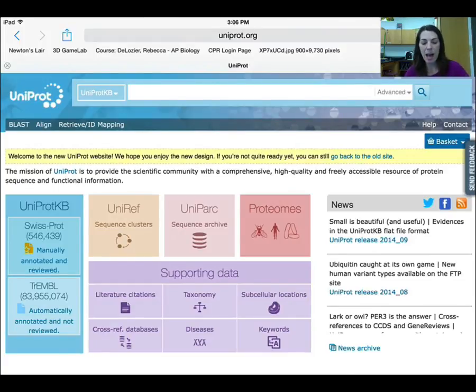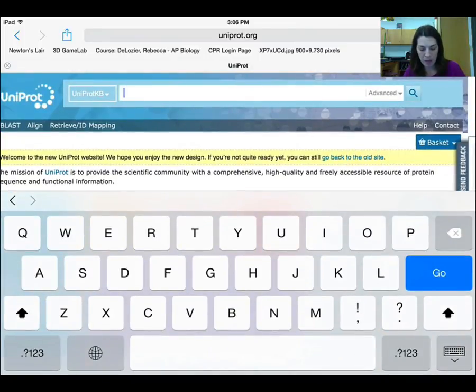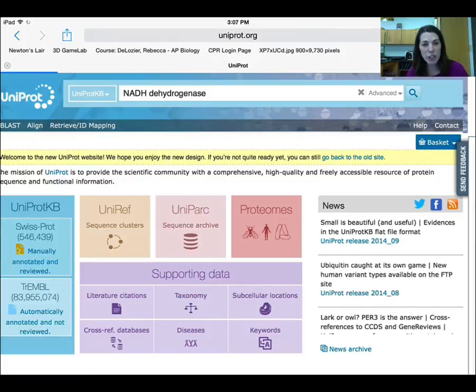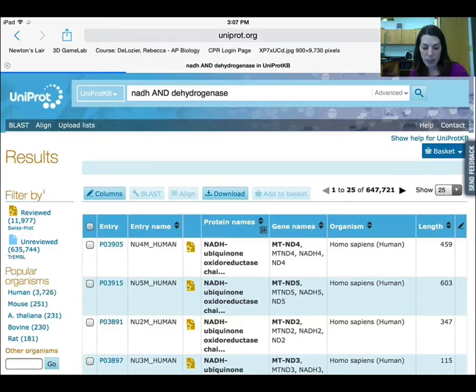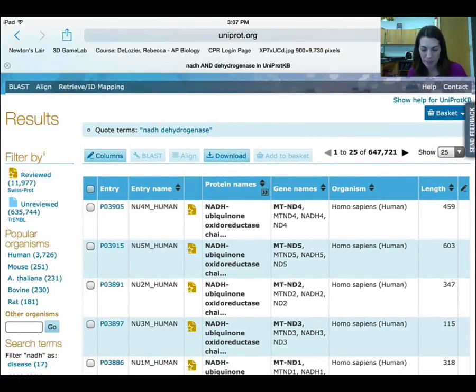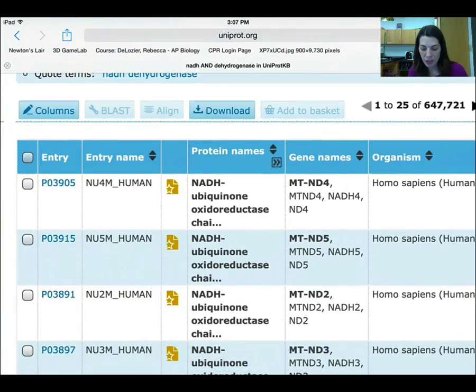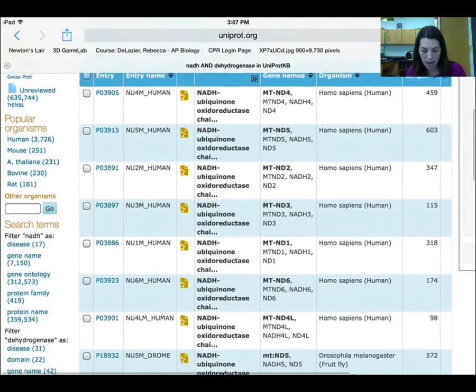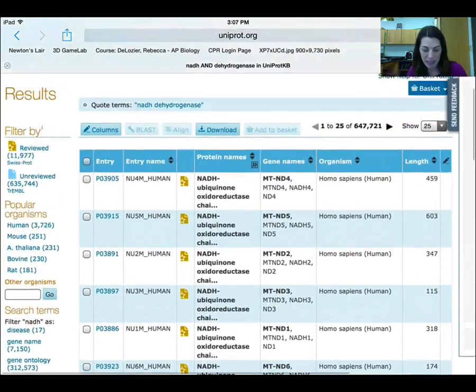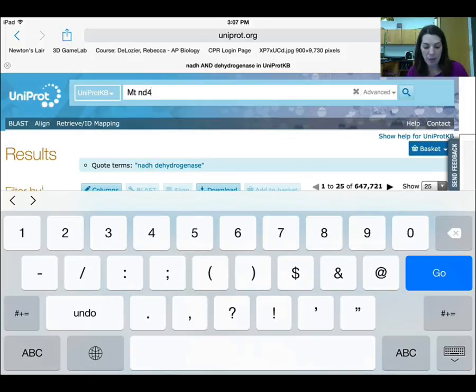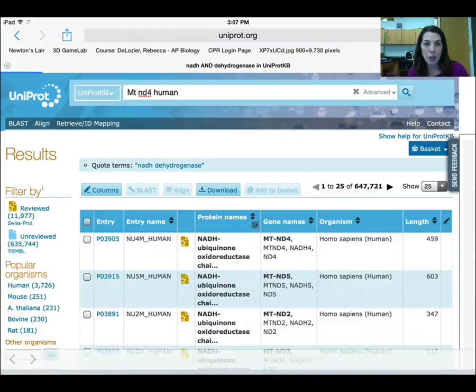You guys are going to be searching for hemoglobin. I'm actually going to search for NADH dehydrogenase because I'm not doing your lab for you. Search for your gene name and it's going to give you a whole bunch of different queries. I'm going to look at the gene names and select organisms that have the same gene name. I'll search for MTND4 — you could search for MTND4 and then a species name. For example, if I want human I can do that, and you would be searching for hemoglobin human.